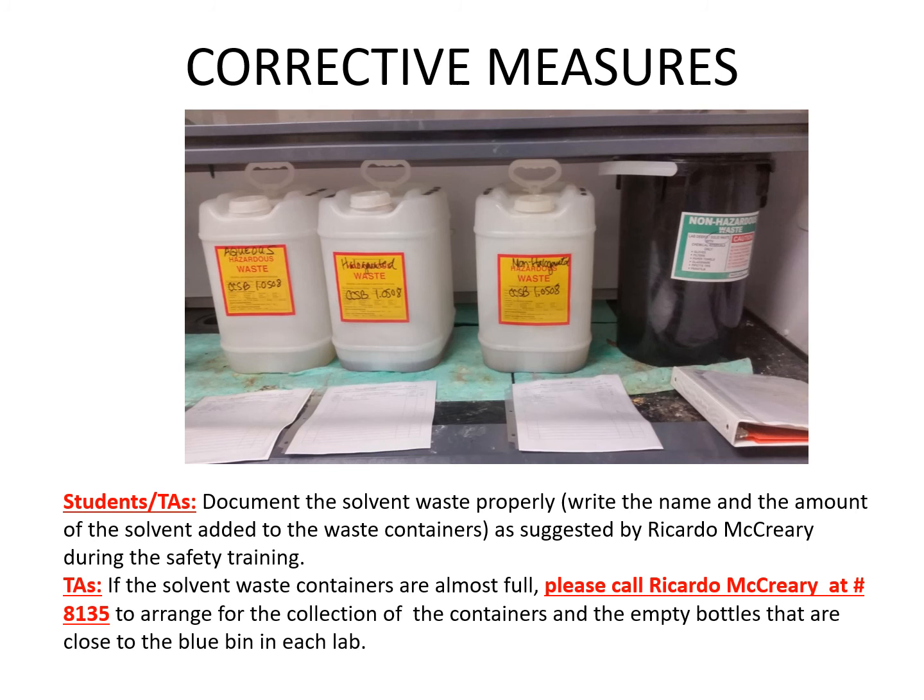So, like I said, if there's any problems at all, the TA will help you with it. If something is full, you always call Ricardo McCreary at Environmental Health and Safety. He'll come and do a pickup. Generally, we don't have the students do that. The TA will take care of that, but you might be asked at some point who would pick up some waste, and it would be Environmental Health and Safety or Ricardo, one of the two. But this is how it should look.